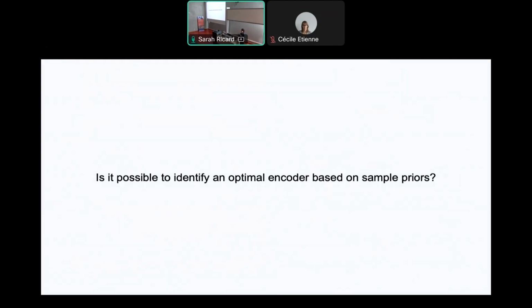One of the reasons I'm very interested in this is because in the first part of the presentation, I told you all about how we were able to generate two-photon excitation from these very well-defined regions in 3D. So in sort of complicated speak, I have a huge amount of priors on my sample. Basically, I know exactly from where I'm exciting fluorescence. So I don't need to image everything all at once. I need to maximally obtain signal from the points that I know that I'm exciting. That's kind of a complicated way of saying, just make sure that the thing that you actually want to look at is imaged onto your recording.